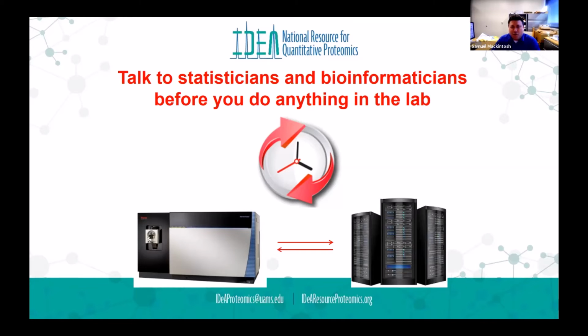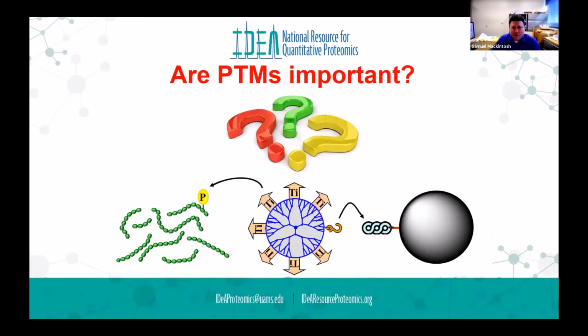Usually proteomics analysis is not the type of situation where you want everyone to be blind. Double blind type experiments don't usually work as well this way. The exception, I guess, would be with certain clinical samples, where you would not necessarily have the patient group information.